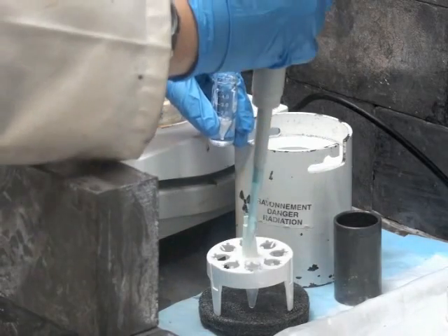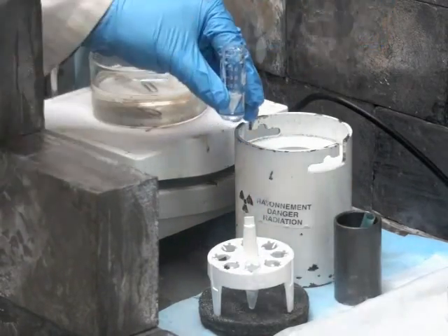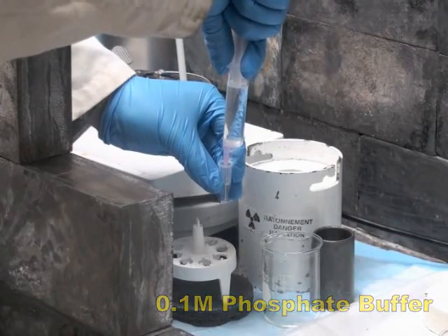Allow the labeling reaction to proceed for 5 minutes at room temperature. Do not stir the solution. Dilute the solution with 10 times the volume of 0.1 molar phosphate buffer.